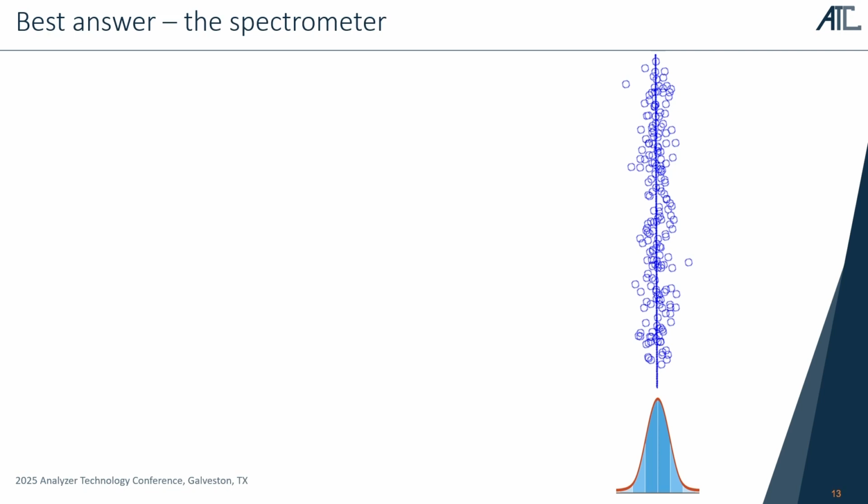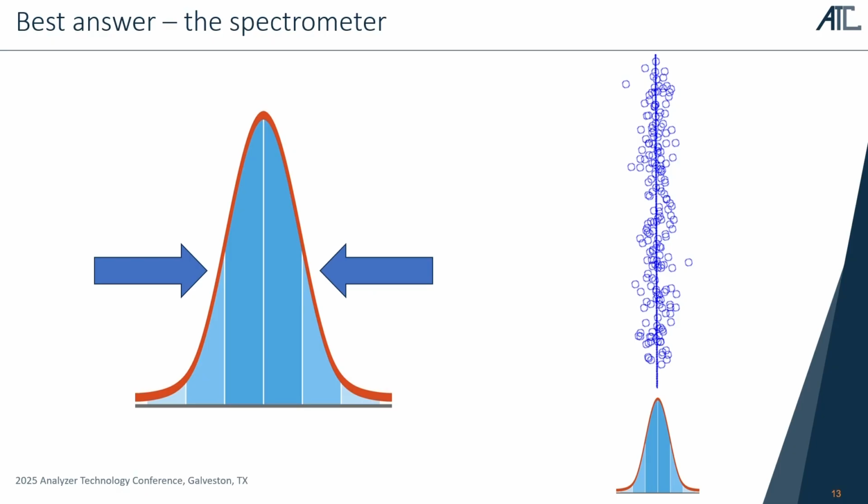Whenever you look at a Gaussian distribution, what do you say? Best value is that apex. That's represented by the line, the regression line that we have for doing, in this case, octane. So what we have is a way of squeezing down the error, knowing that we have a more precise measurement in the mix.